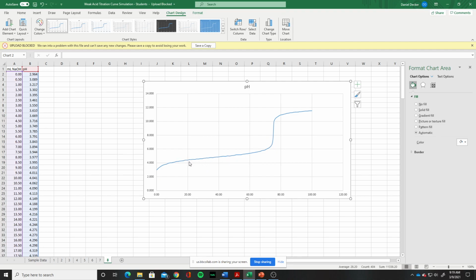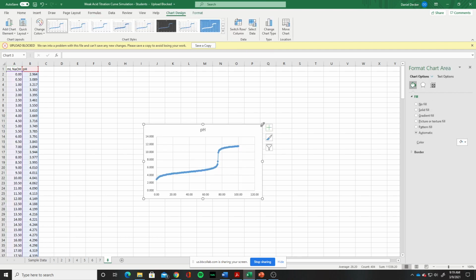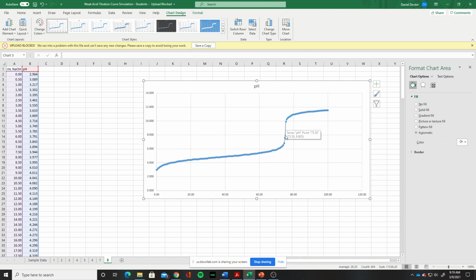It's the same data. It's just not showing you the individual data points. Me personally, I didn't write this lab. I would have had you show the data points. But you can do it either way. The data points aren't so far apart that I'm worried. The reason why I like to see the data points is because sometimes students make a graph, and there's a little bit of a gap there, but that's not unusual at all near the equivalence point. They'll essentially be hiding the fact that they don't have very many data points by just not showing the data points at all. And so that's why I like to see the individual data points. But since I'm giving you this data, I'm not worried about that. So yeah, either way is fine.